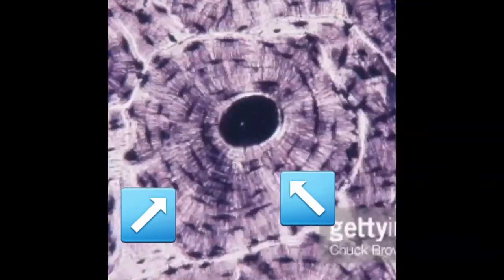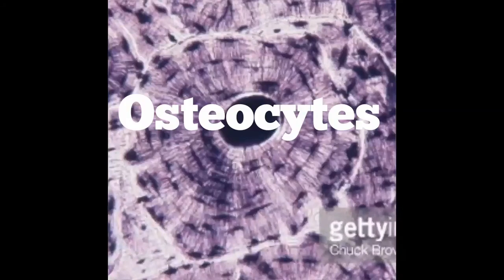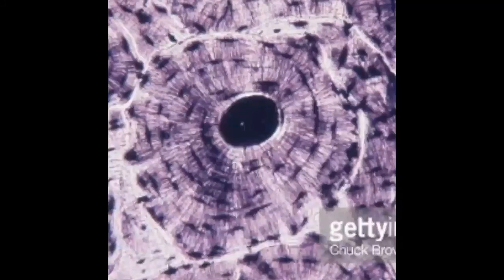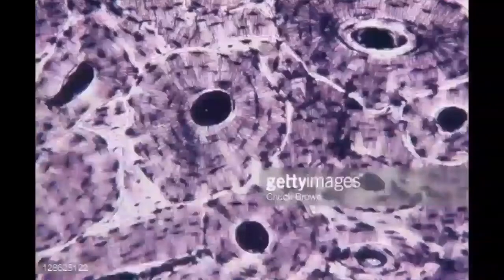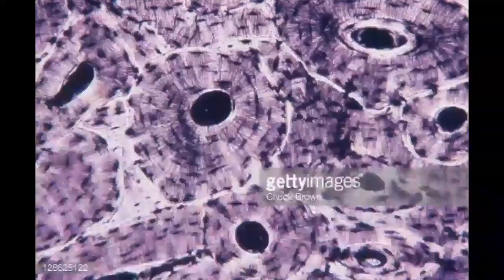And the little tiny spots that seem to be like dotted lines of each one of those circles are actually bone cells or osteocytes within a protective shell called the lacunae. And the little tiny hair-like projections found here are like channels for these bone cells or osteocytes to exchange gases and nutrients and waste and stuff like that. The last structure that you can see on this slide under the microscope is called interstitial lamellae, and that is just all the bone matrix found in between each osteon.